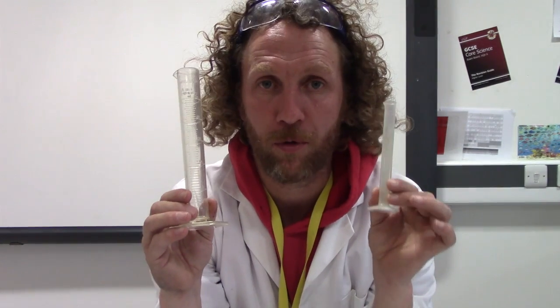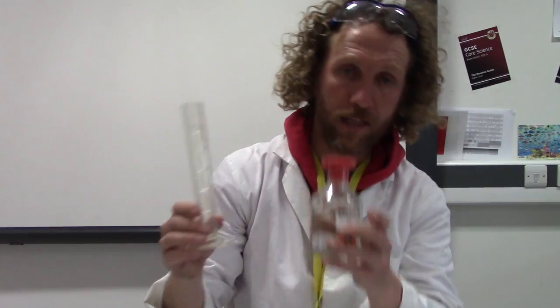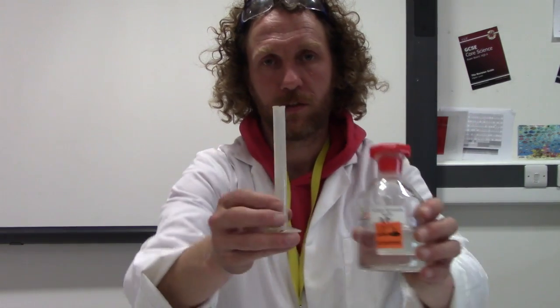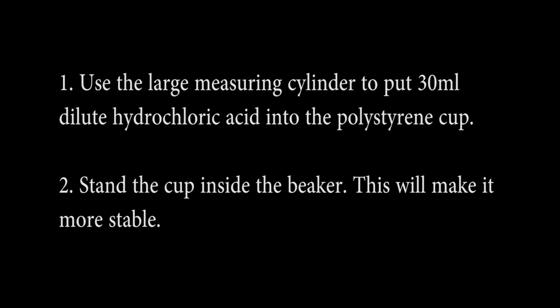We're also going to need some measuring cylinders. It's always nice if you've got two different sized measuring cylinders to use for two different chemicals so you don't get confused. We'll be using the large 50 ml measuring cylinder for the acid and we're going to be using the small one for the sodium hydroxide. Keep them next to each other — the measuring cylinder and the acid, and the measuring cylinder and the alkali. And I'm just going to use a couple of pouring beakers just to pour the acid into and then pour that into the measuring cylinder — that's far easier. You've got a method to follow and we will follow that as we go.